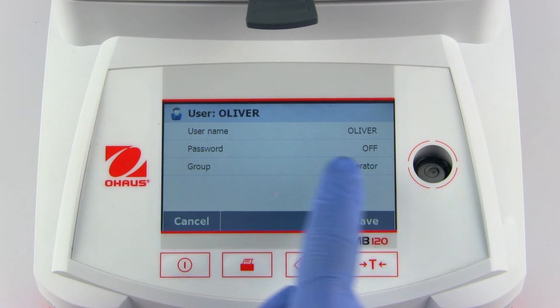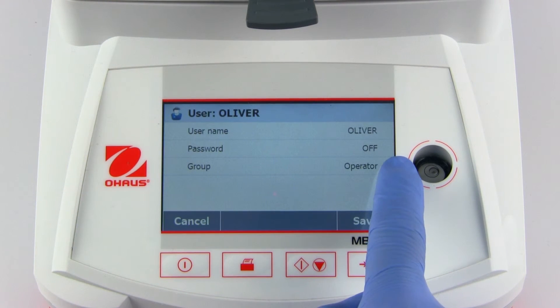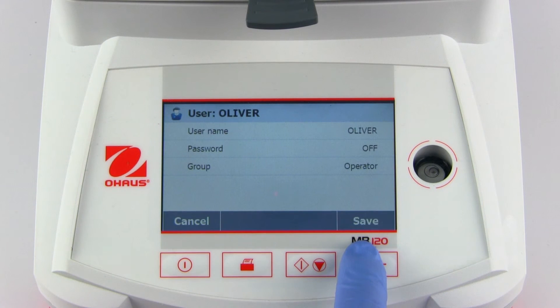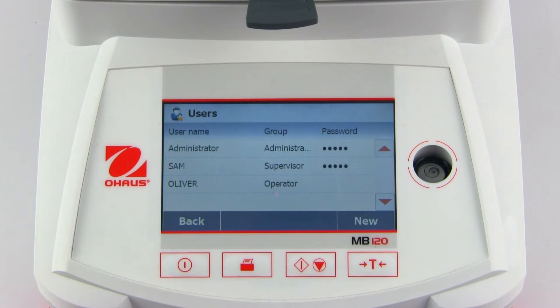Oliver will be assigned to the operator group by default. Since Oliver is an operator, he does not require a password. Anyone can log in as Oliver and make a measurement.